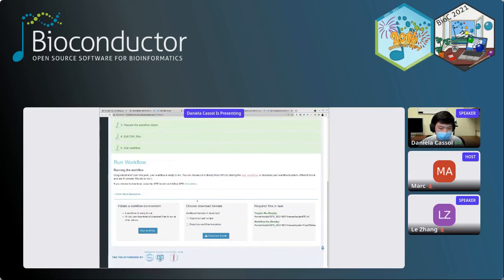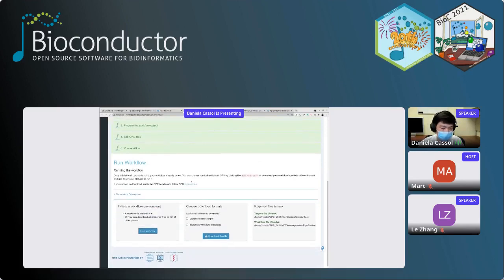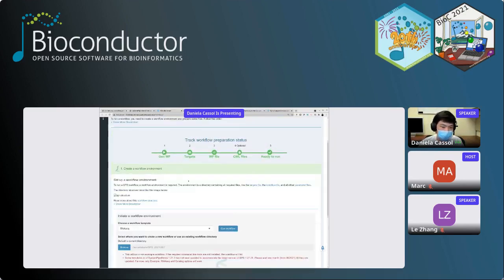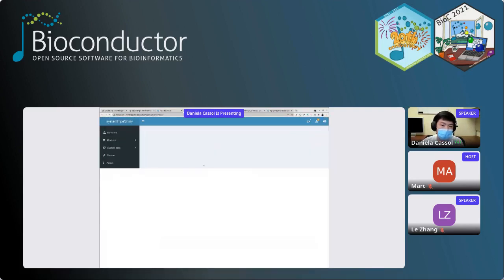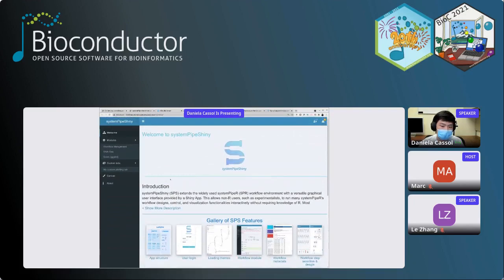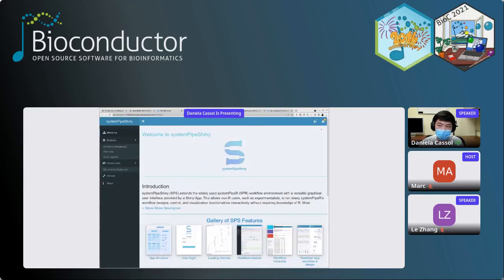For here, like I said, I will change to the example workflow and run the workflow. That will save us much time. So first, you just refresh the Shiny app to give you a new session. A new Shiny session. There's no need to restart, just refresh the tab. So here are some interactive guides you can play with. They're over here. Now we'll also have notifications over here.